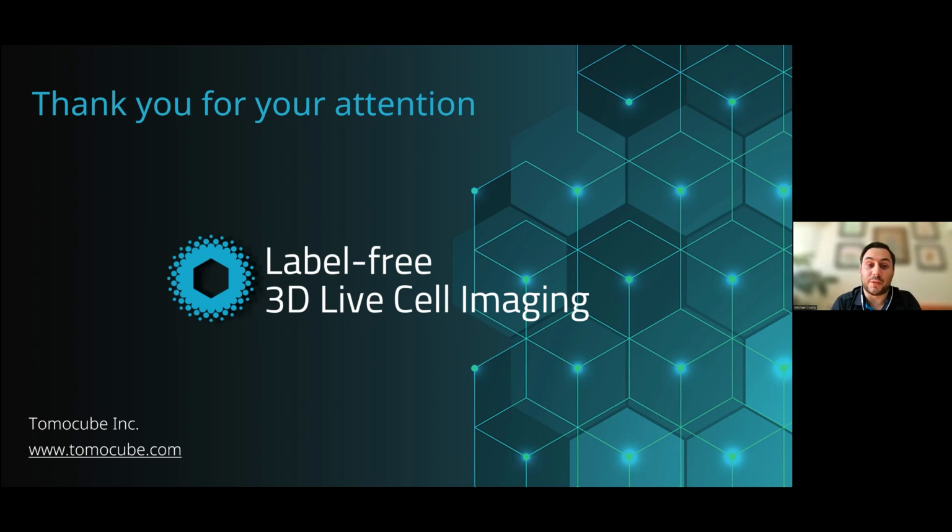Yeah, no, that's perfect. Another question that we had was, which subcellular structures and organelles can be visualized? Is it possible to image the ER or vesicles?